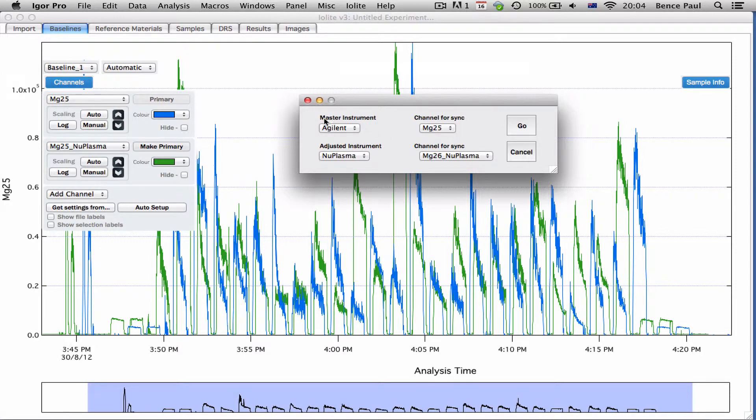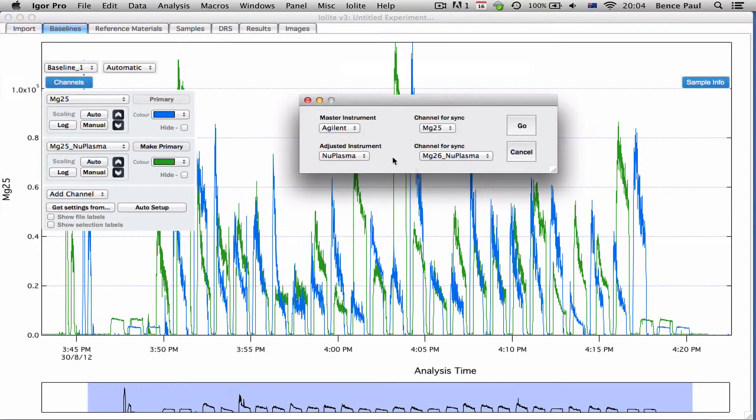This window will pop up and it'll allow you to choose which is the master instrument and then there'll be an adjusted instrument and the time waves for the adjusted instrument all have the offset applied to them.